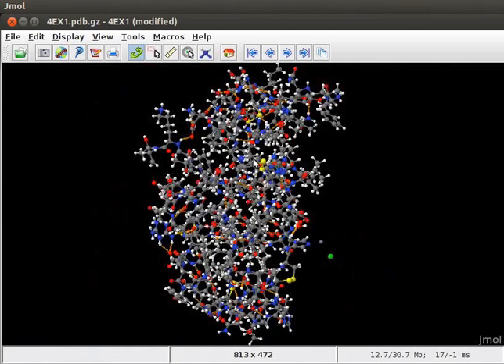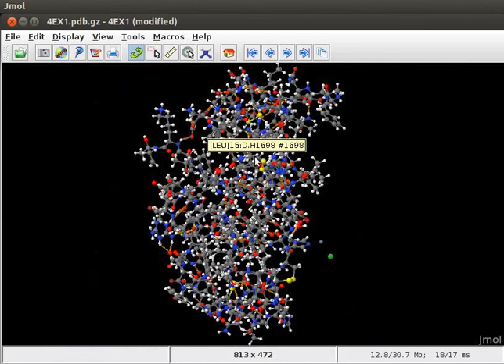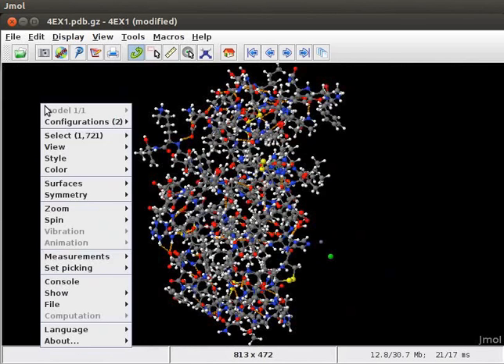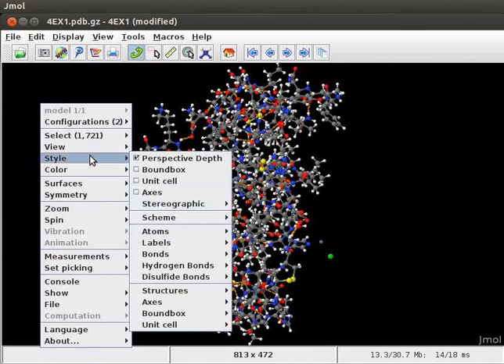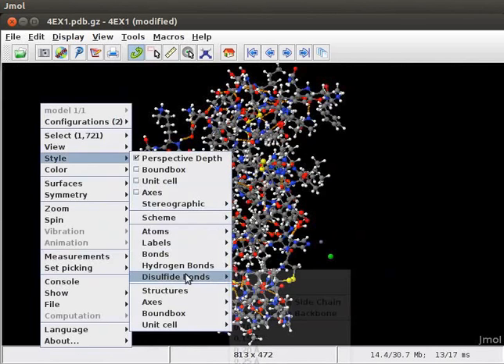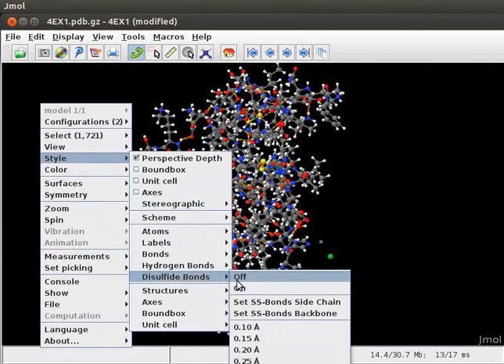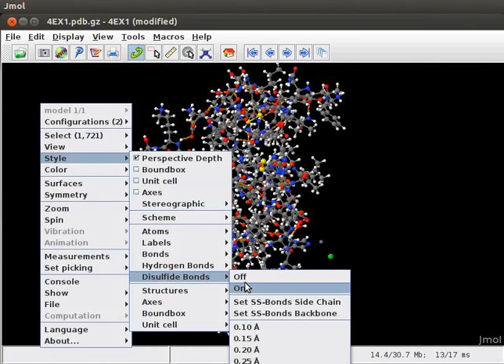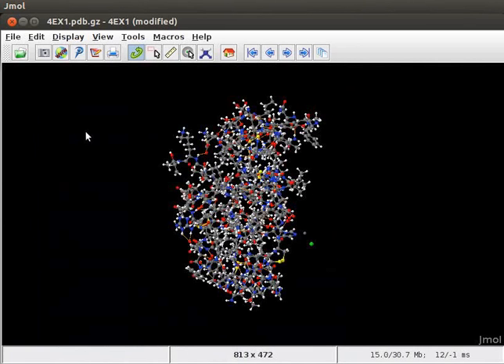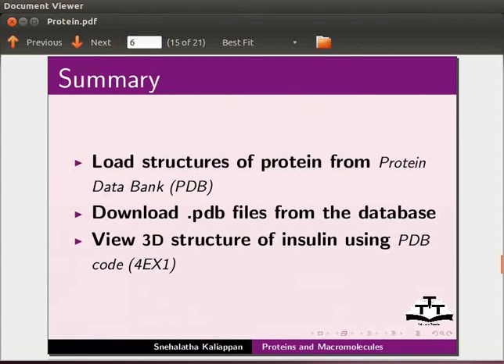Disulfide bonds and Sulphur atoms are shown in the model in yellow color. To modify the disulfide bonds, open the option Disulfide bonds in the pop-up menu. Click on the features you may want to change like size, color, etc. Similarly, try to open .pdb files of different enzymes and view their 3D structures.